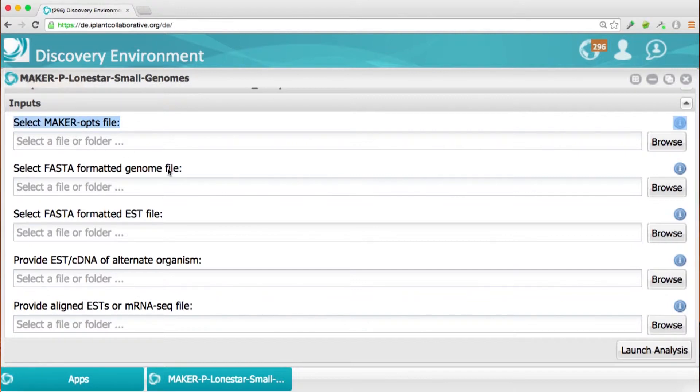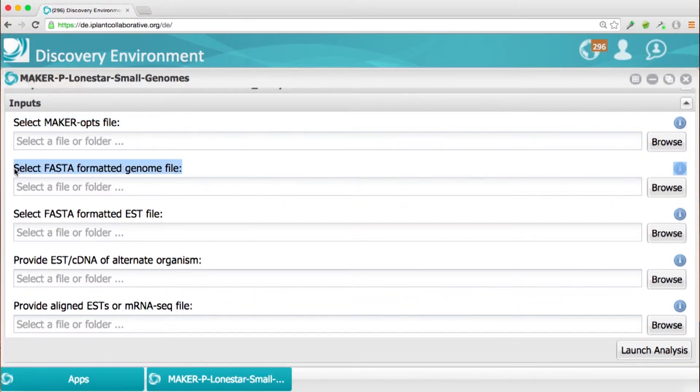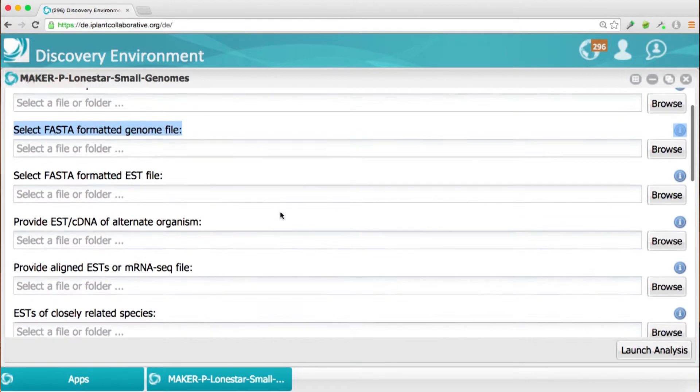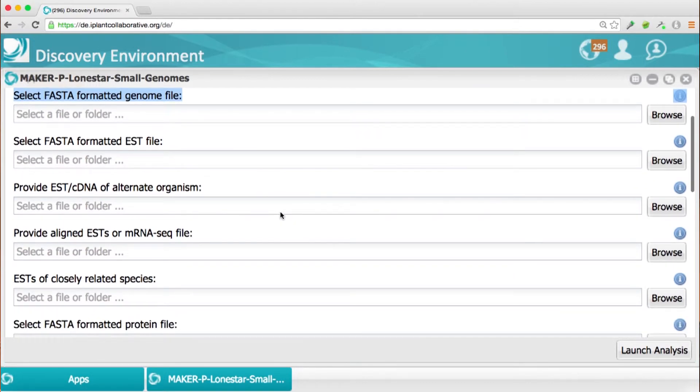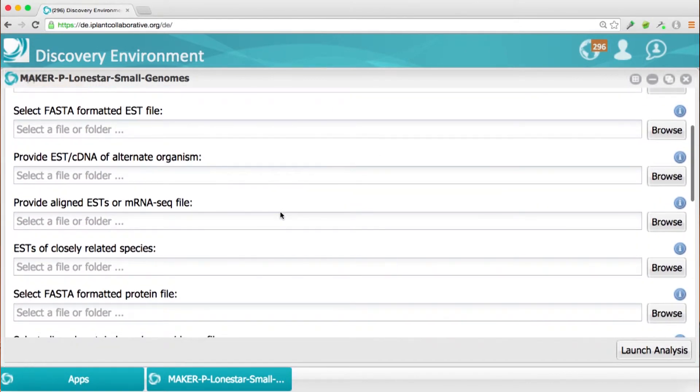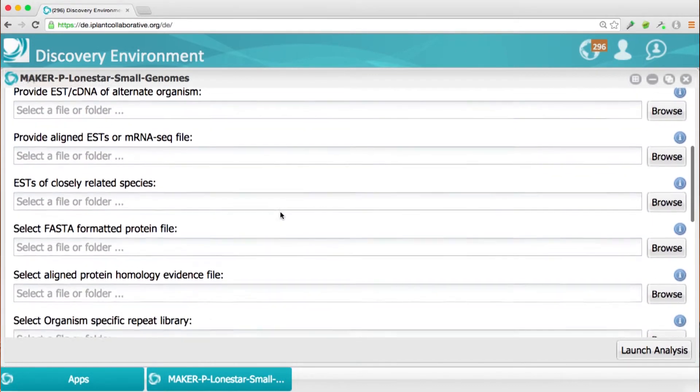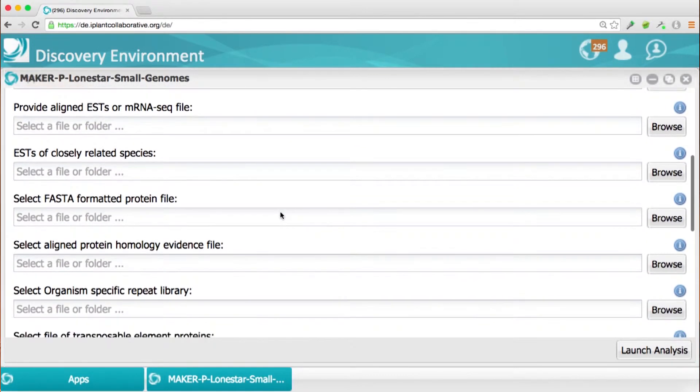And also MAKER has something called a MAKER Ops file. And there are two options that are built into this particular app. And one is to be able to either select your own MAKER Ops file or define the parameters, and that will create the MAKER Ops file on the fly.